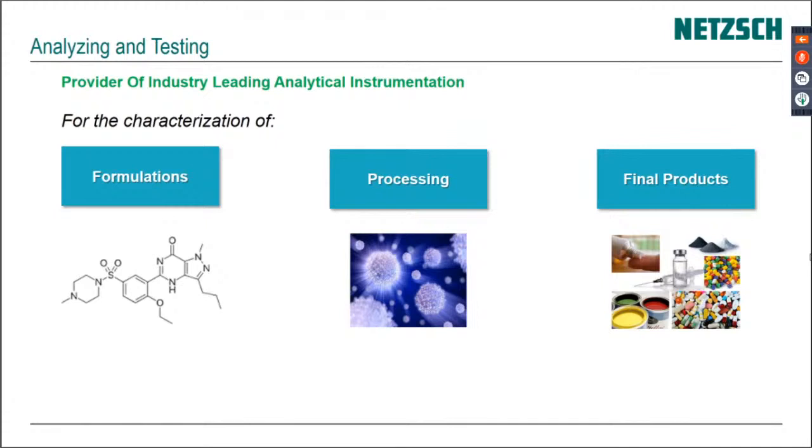So when you're looking at pharmaceutical rheology, you could be using rheology in the area of formulation, obviously, or in processability, or in the performance of the final product. The final product obviously wants to be stable, and the formulation plays right into that stability. So there are some aspects where these things tie in together, and also the material needs to be processable. You need to know how much time to mix the components together to get a homogeneous mixture. And we can see these things with rheology.